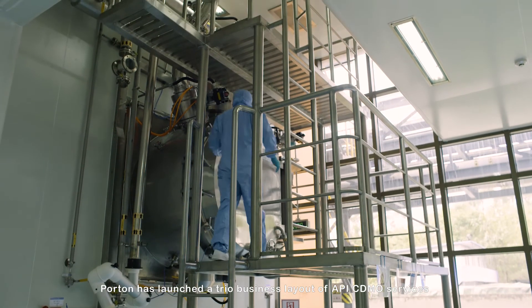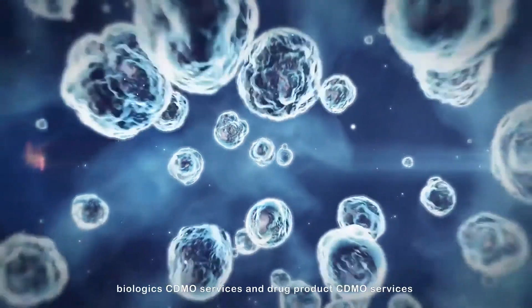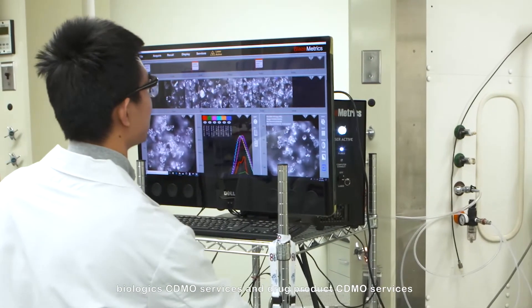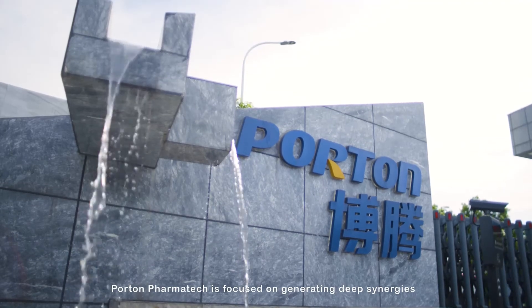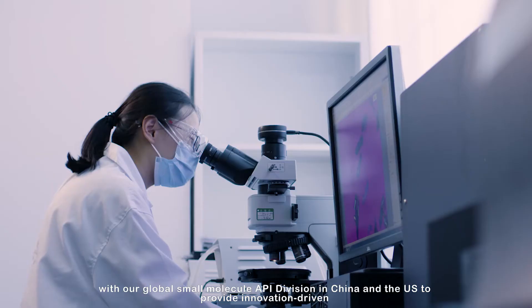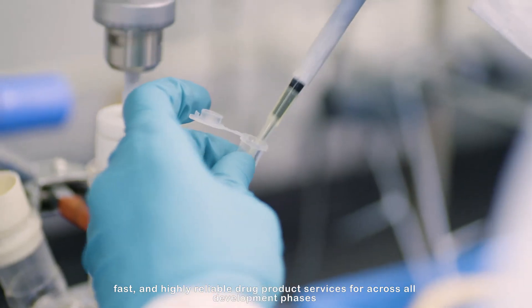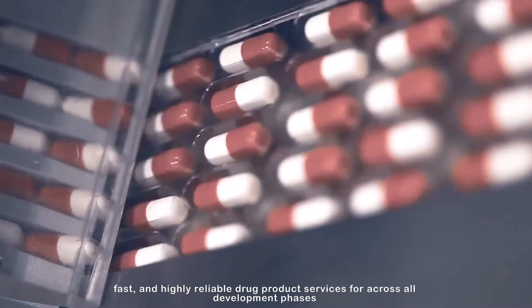Porton has launched the trio business layout of API CDMO Services, Biologic CDMO Services, and Drug Product CDMO Services. Porton Pharmatech is focused on generating deep synergies with our Global Small Molecule API Division in China and the U.S. to provide innovation-driven, fast, and highly reliable drug product services for across all development phases.